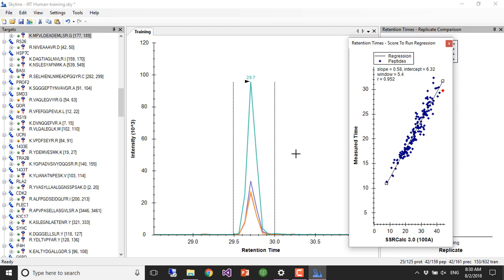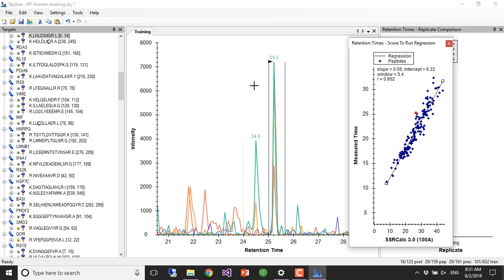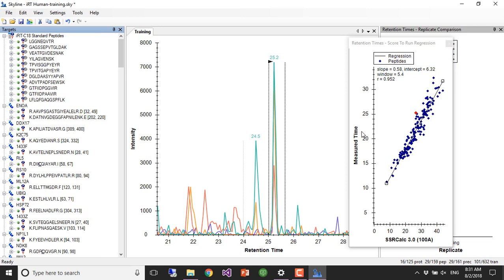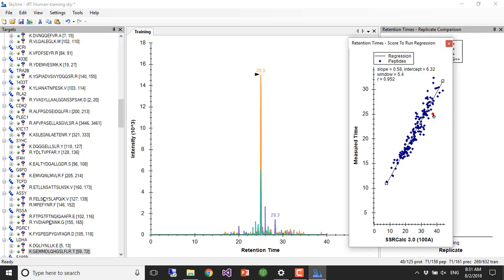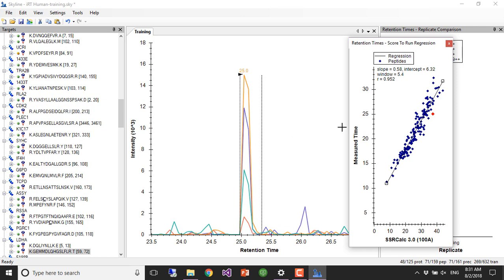And you could imagine wanting to go through all of these and check where they're expected to be versus where they actually show up. And Skyline makes it nice and easy with its interactive graphs to view this stuff. With what I call directed investigation, you don't need to go through systematically. We haven't gone through systematically. We just picked some things that looked odd.